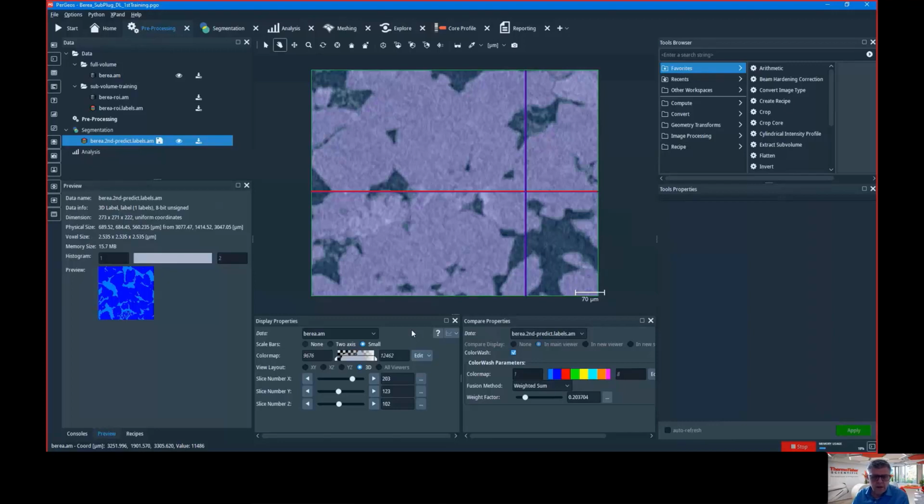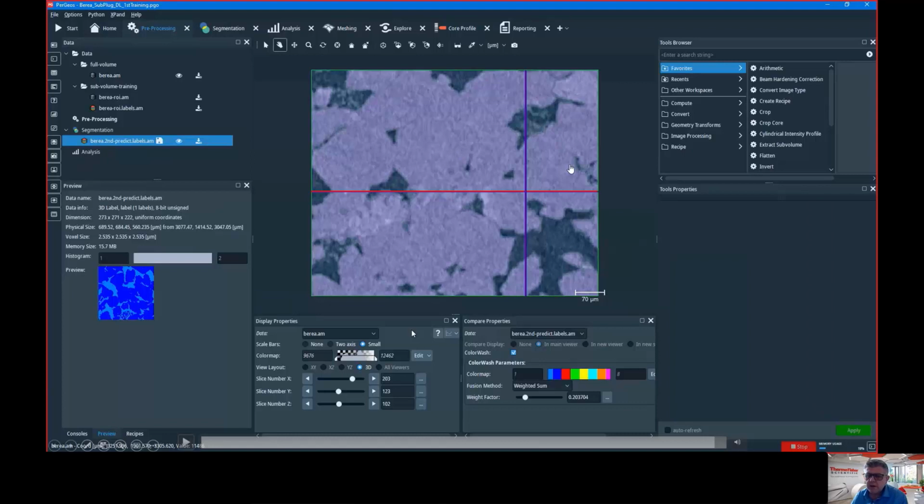And it doesn't really matter, of course, it should be an image in the same class. I cannot do prediction of a sandstone and shale with the same model. So you have to train with the same class of rock to get a result. For instance, train with FIB-SEM and try to predict a micro CT, they are not the same type of image.